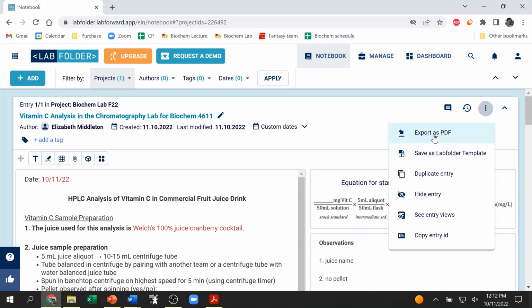Okay. When you do that, it'll give you a download link. You can download it and then you can submit it through Moodle the same way as you have with your other notebooks. It does change the formatting some, so it might move around these different elements. That's fine. Don't worry about it. We'll be able to find it. Just make it look the way you want as you're using it on the screen.